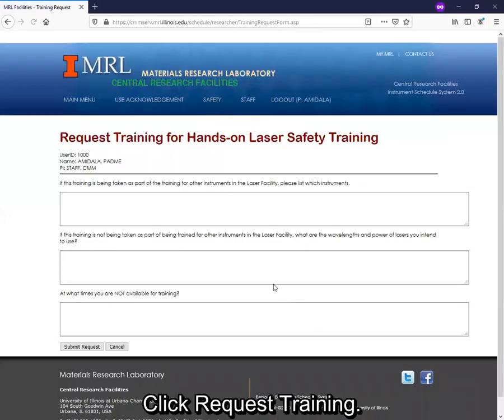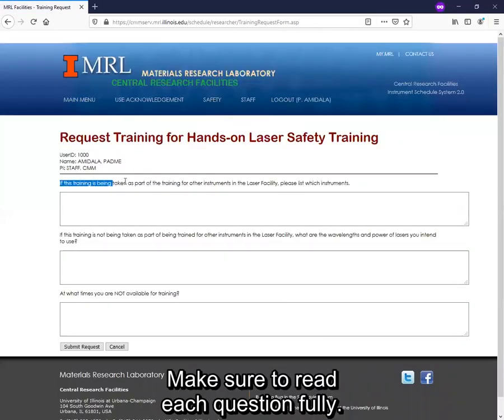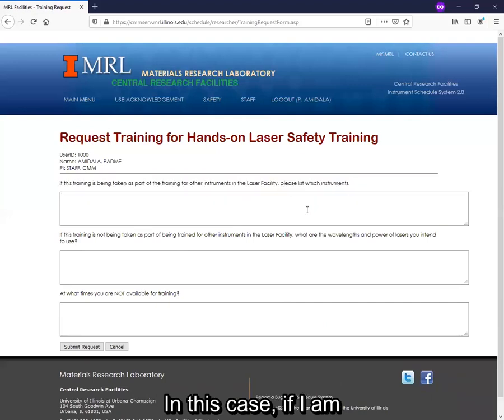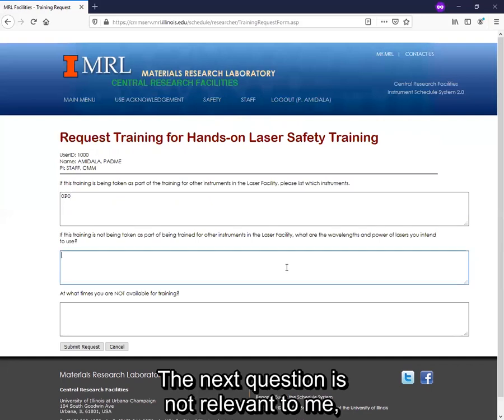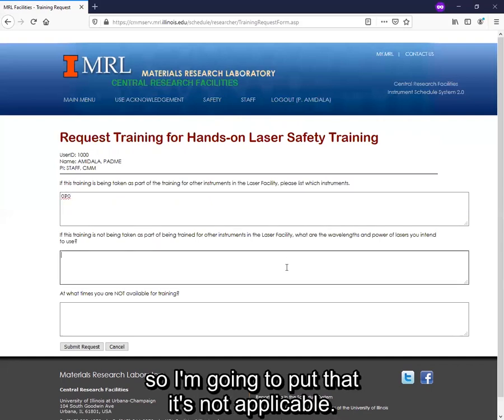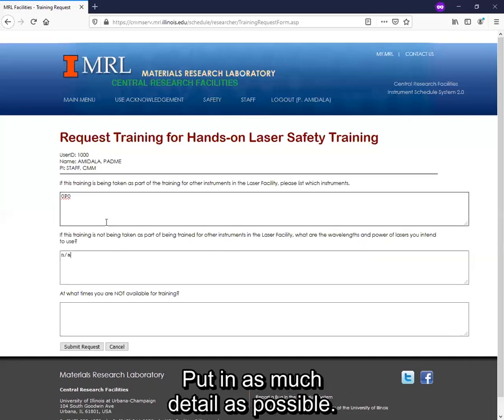Click Request Training. Make sure to read each question fully. In this case, if I am interested in using one particular instrument, I'll put that in because that's what the question asks. The next question is not relevant to me, so I'm going to put that it's not applicable. Put in as much detail as possible.